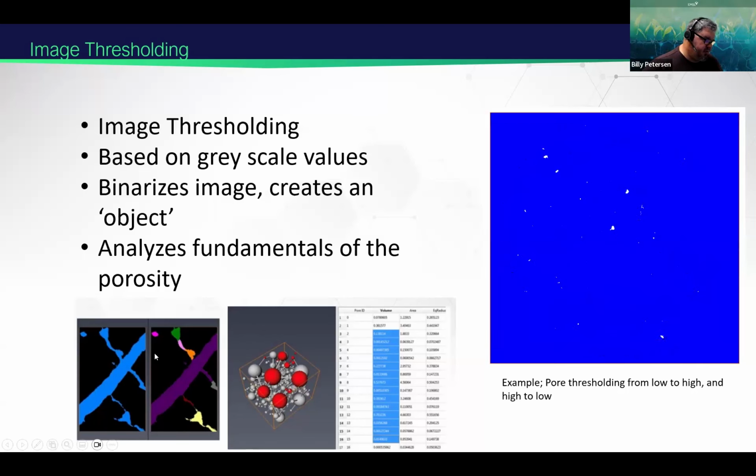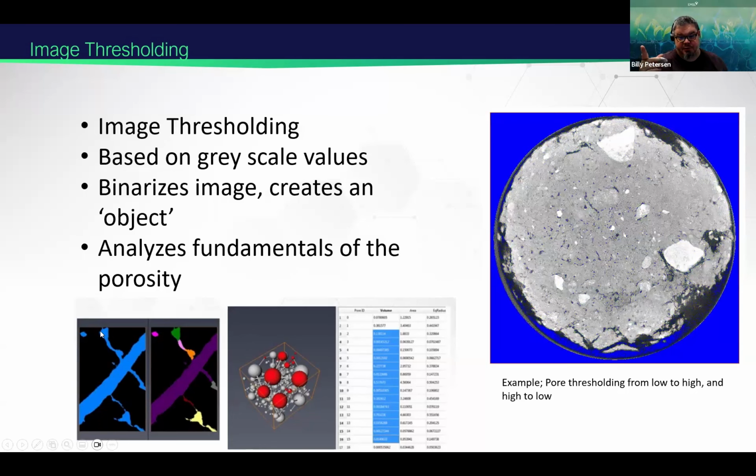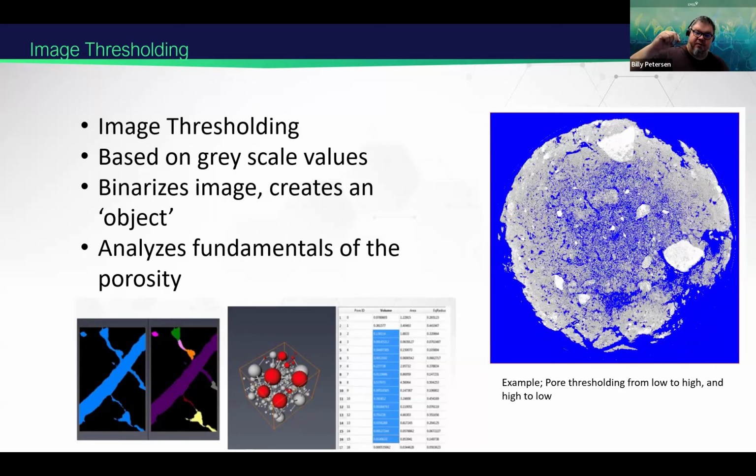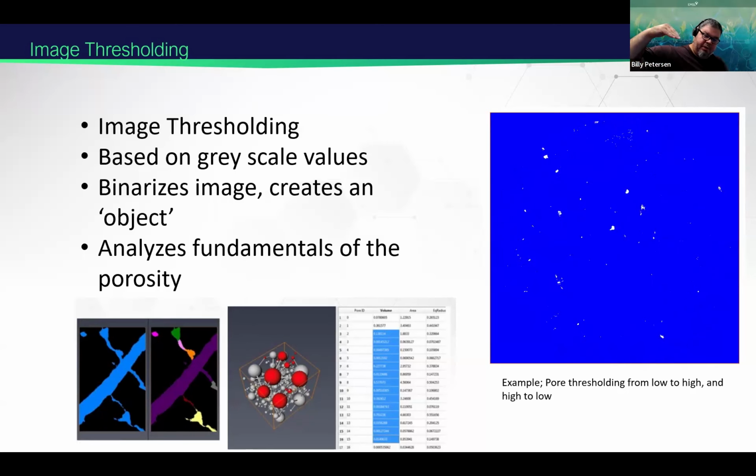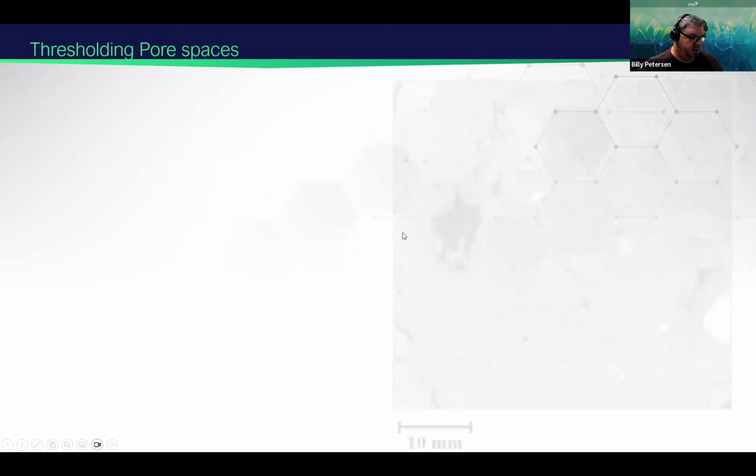And it's going to say, okay, here's a pore, now here's a pore, here's a pore, here's a pore, based on the geometry, the shape, and the rate that the voxels change. So with those grayscale values, that is actually what it's doing with its statistical analysis, telling you, we believe right here it's going like this. So it will base it on the rate of change.